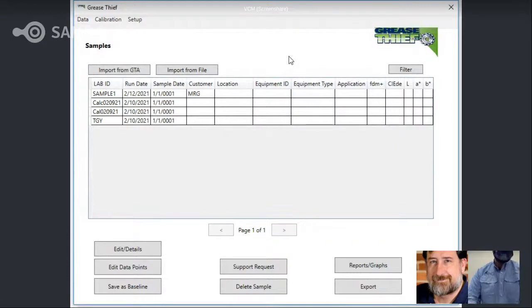All right. And then next I see is, do the results we see from die extrusion tests have any correlation with shear viscosity? So, answer this: shear viscosity or apparent viscosity is a specific test that can be performed on grease at a given shear rate. As a non-Newtonian fluid, grease's viscosity varies based on the shear rate. So this is how a rheometer can be used to test and evaluate grease flow properties. So it's a different flow property.